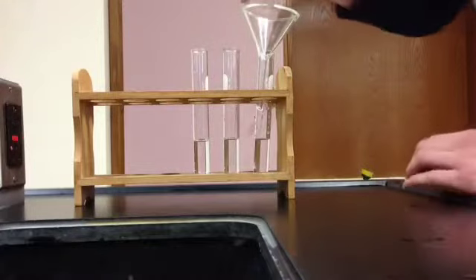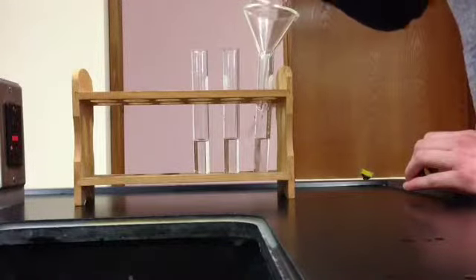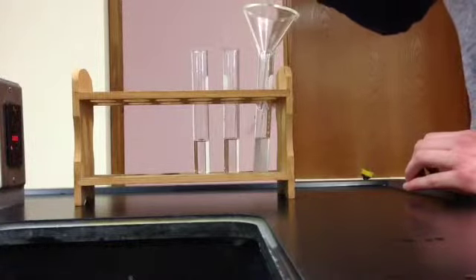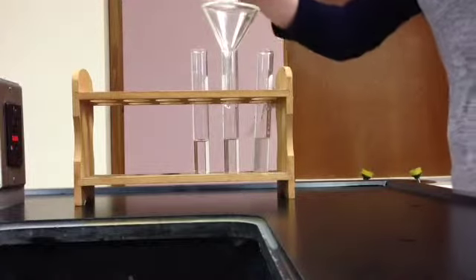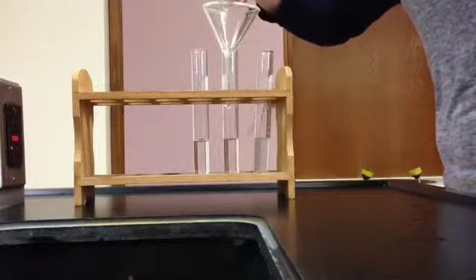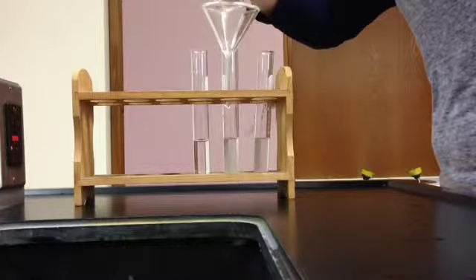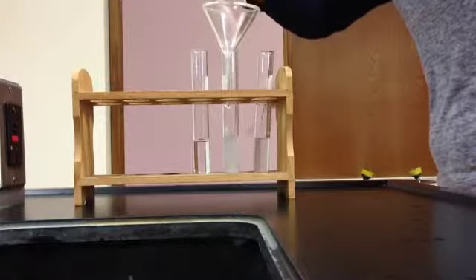In the first test tube, I poured 1.25 grams of salt, which should dissolve because the solubility of salt is 3.62 in 10 milliliters of water. In the second test tube, I poured 2.20 grams of salt, which should still dissolve because it is still less than the solubility of salt, which again is 3.62, and you cannot change that number.